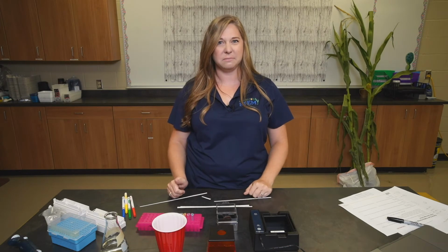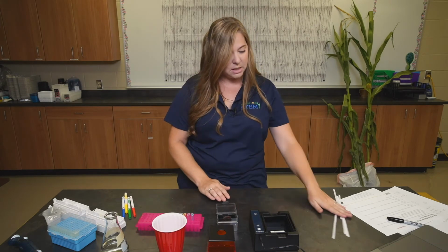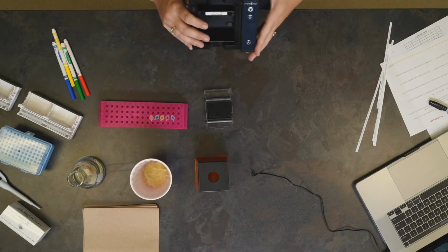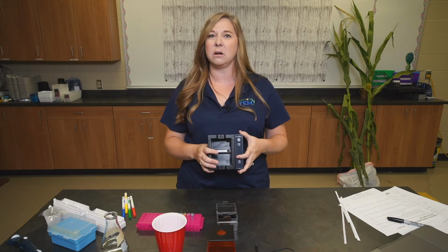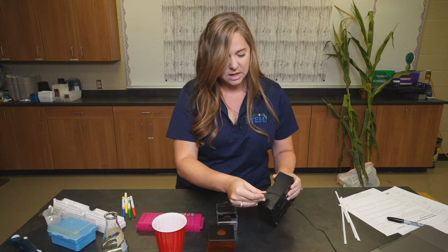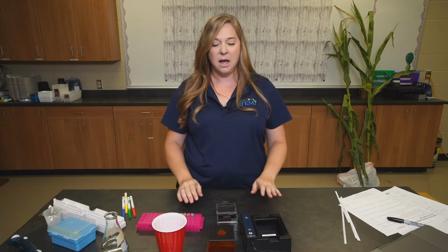That's our next part. Today, we're going to be using the MiniOne system that is available to you through checkout through Kansas Corn STEM. If you are interested in checking these systems out, please make sure that you go onto our website and go to the Request Materials tab. This system is very easy to use. If you've done electrophoresis before, which is the system that we're using today, this will look like a very simple version of all of the things that we have done in the past.